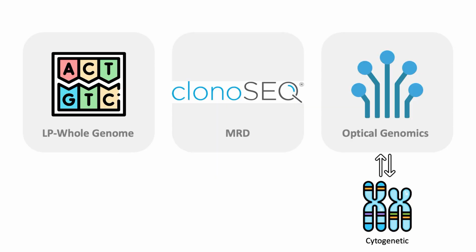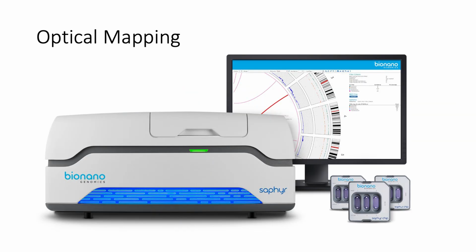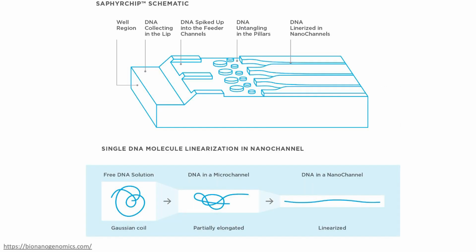The last part is optical genomics, which is really exciting. It's been a while since we saw completely new technologies beside NGS. One of those solutions is called BioNano Saphyr. Basically, they have a microfluidic chip where they put the DNA at the beginning, and then they drag the DNA through nanochannels. The idea is the long DNA, as it passes through the nanochannels, will be stretched. And once it's stretched, it will be imaged.